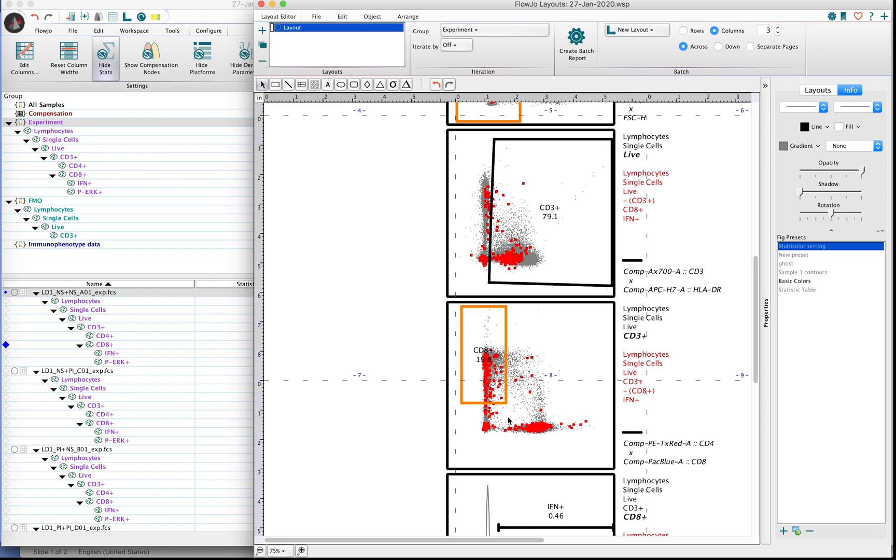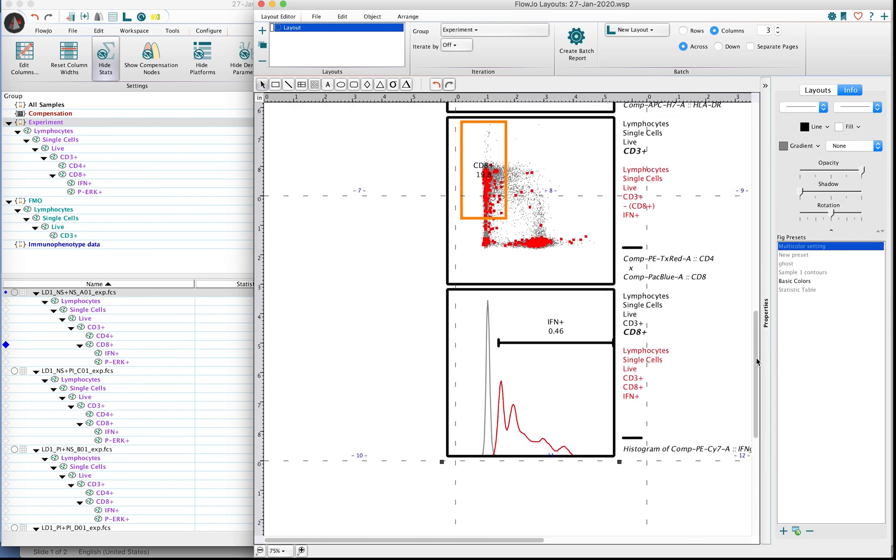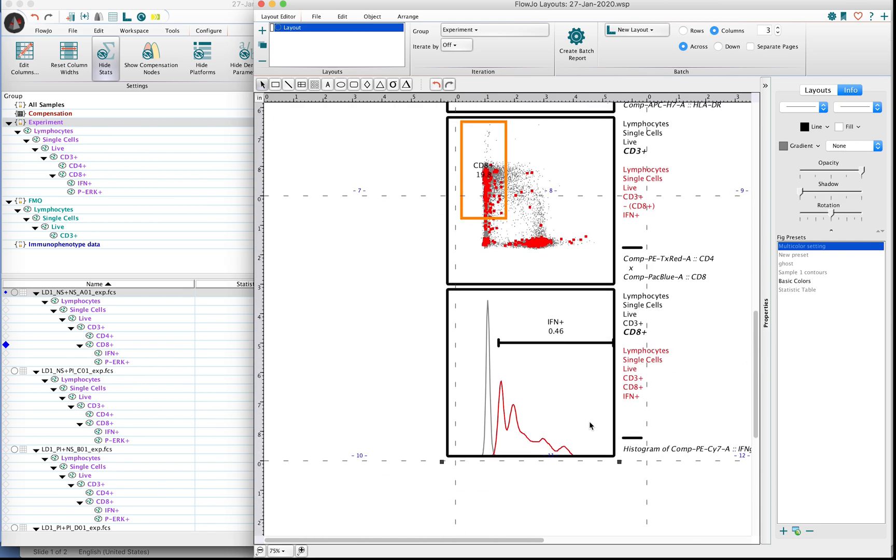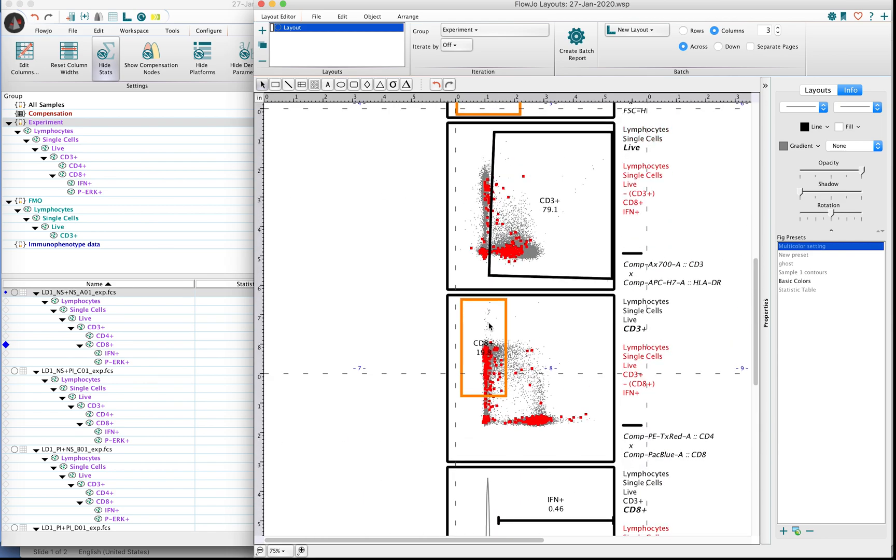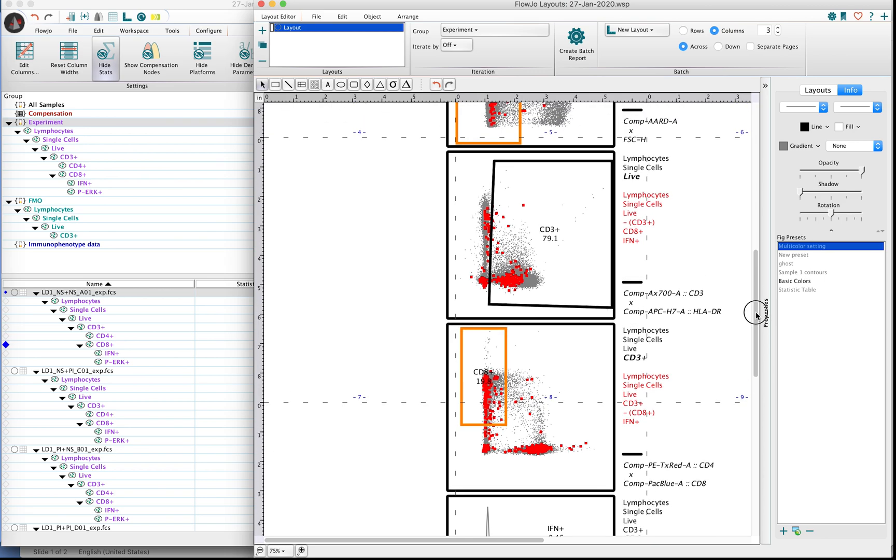The red dots that fall outside of our parental gates, these are interferon positive cells that are not being quantified down here. They're not being counted, obviously, because our ancestral gates here are limiting.